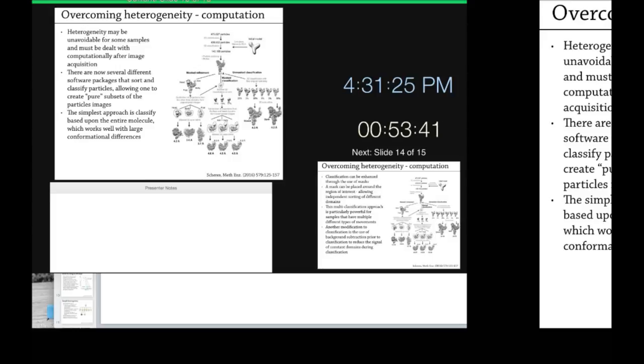If it varies hugely from sample to sample, or purification to purification of the same sample, then you might want to think about what happened on the day when I only lost 10% at 3D classification versus the day when I lost 75%. Did I do something differently? Did I add DTT? Did I take DTT away? Did I end up with a lot of disulfide breaking? There's a lot of things that can cause proteins to become unstable, and you can learn a lot of information by evaluating your 3D classifications.